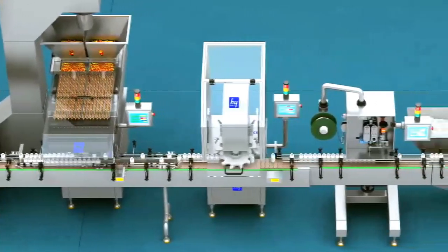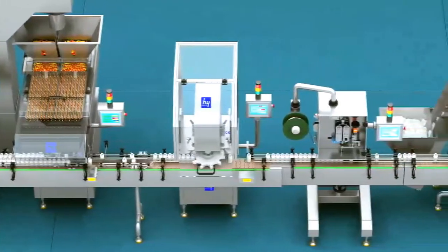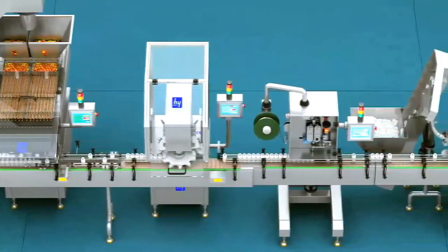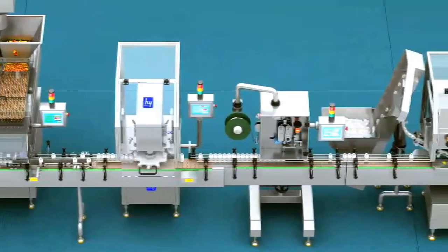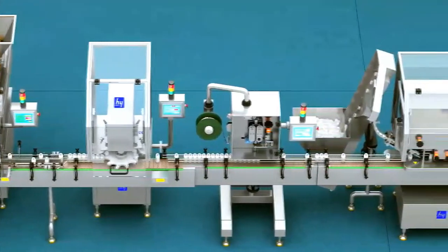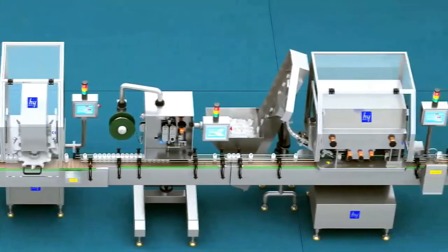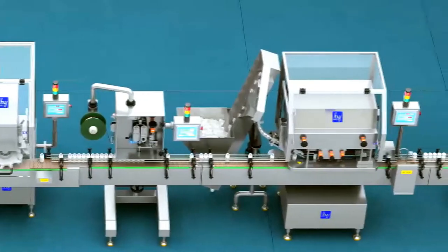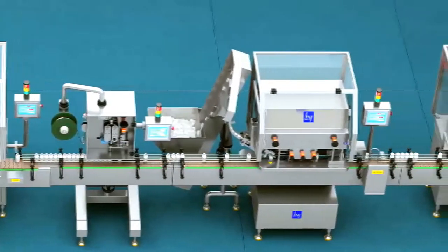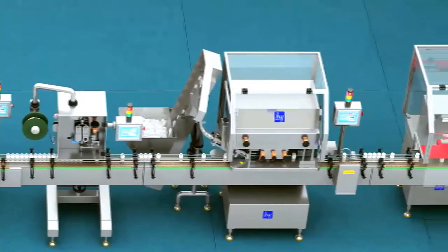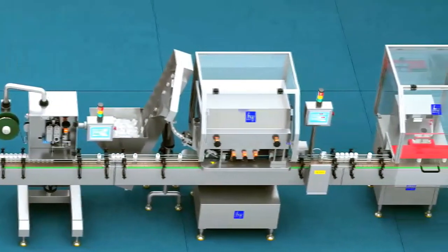The whole assembly line has functions such as automatic arranging, washing, counting, filling, weighing, inserting, capping, foil sealing, labeling, and more.